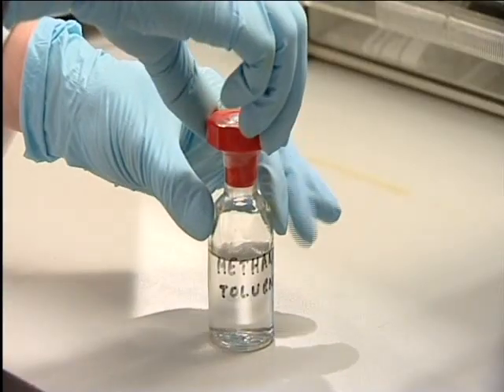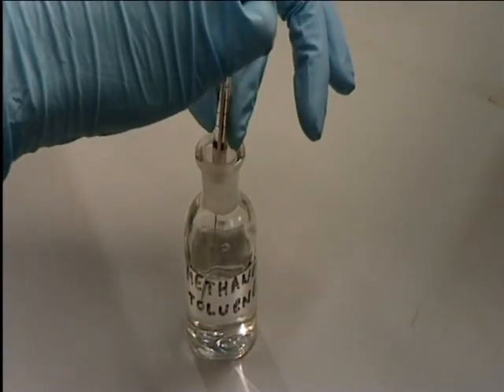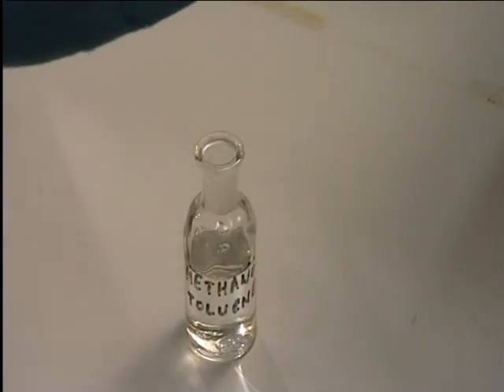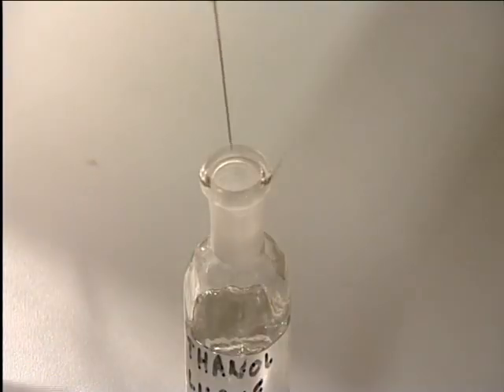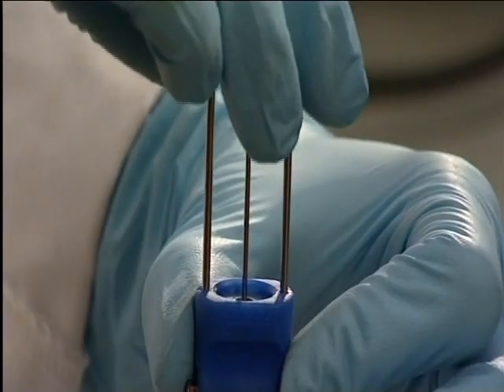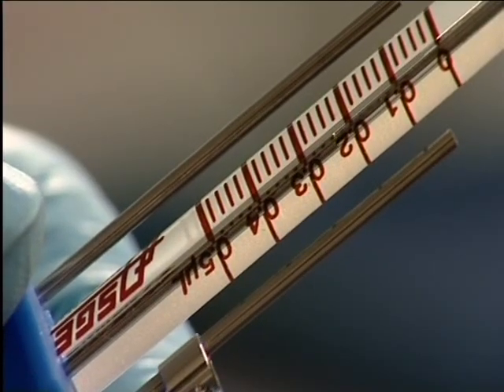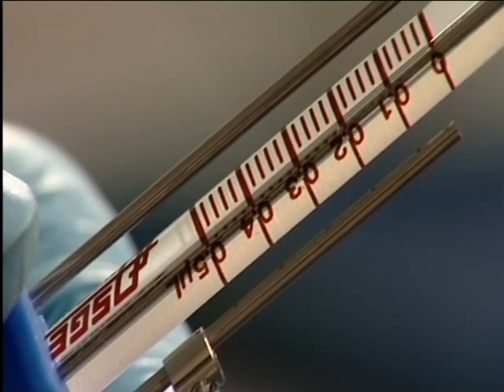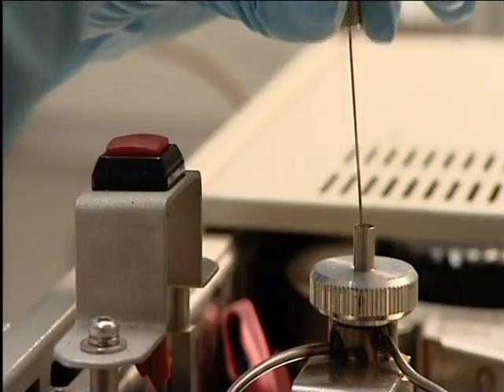Here, we will separate a mixture of methanol and methyl benzene. About 0.1 microliters is taken up in a hypodermic syringe. It is then injected into the inlet port through a self-sealing rubber disc called a septum.